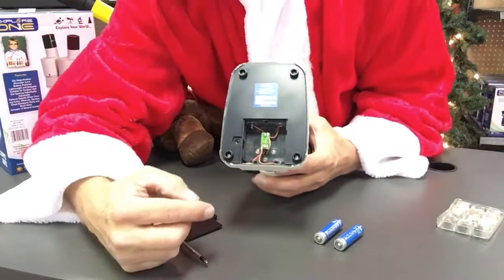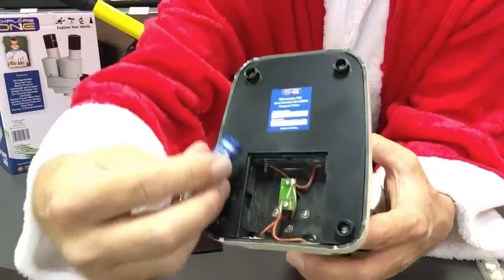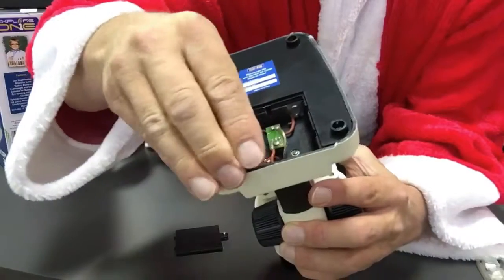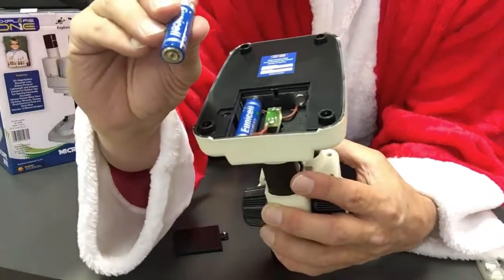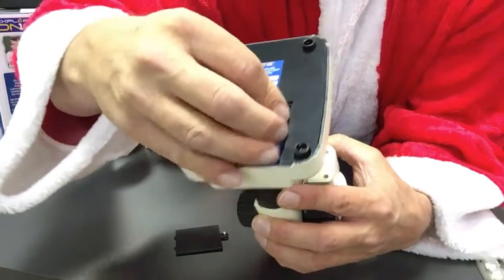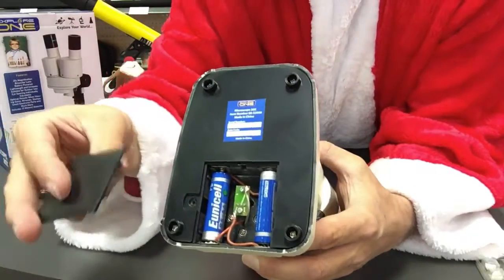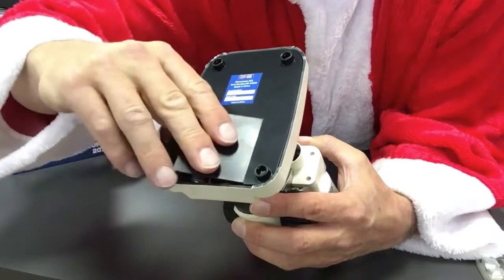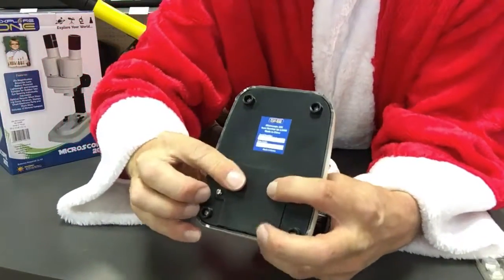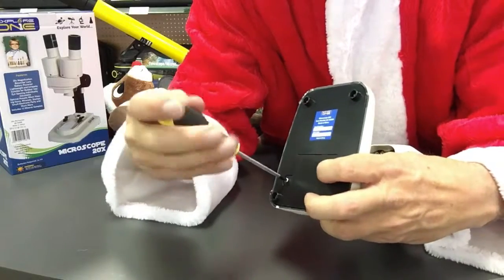We've got a compartment right here where the batteries fit in. The batteries fit in this way — there's the positive tip here, and that is going to go down. So we pop that in like that. And then we've got the positive tip up, and we're going to pop that in like that. Be careful with these wires because we don't want to break a wire. Then we close it back up. If you need help with this, you can get your mom or dad to help you. And there we go, it's all tightened up.